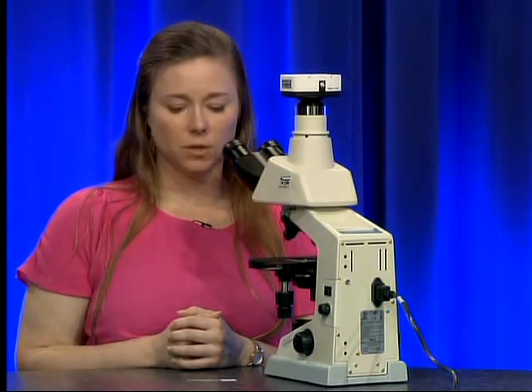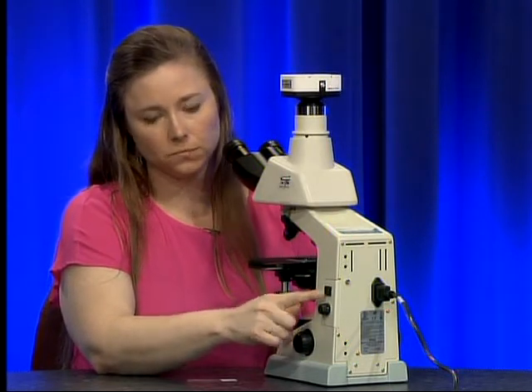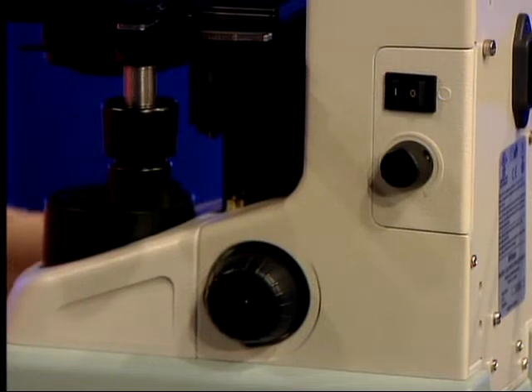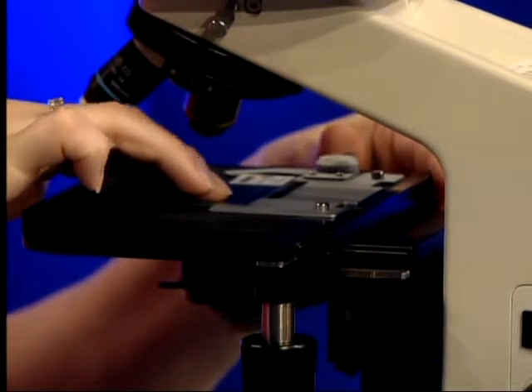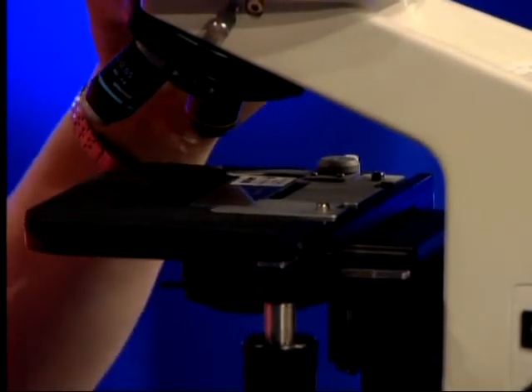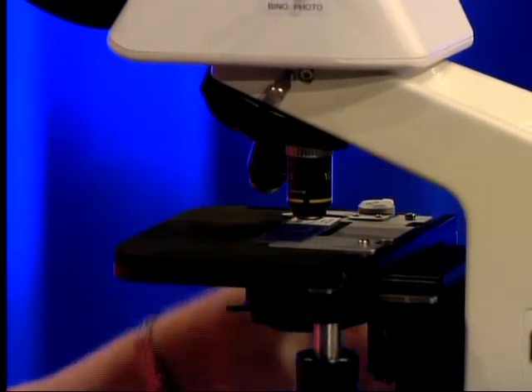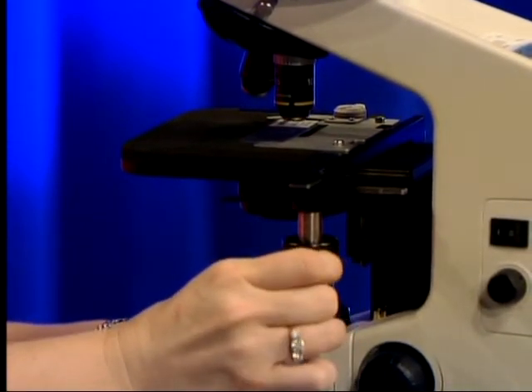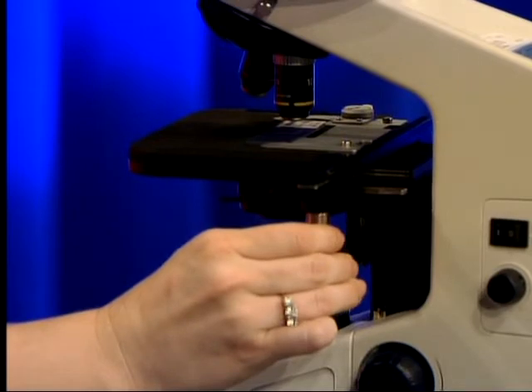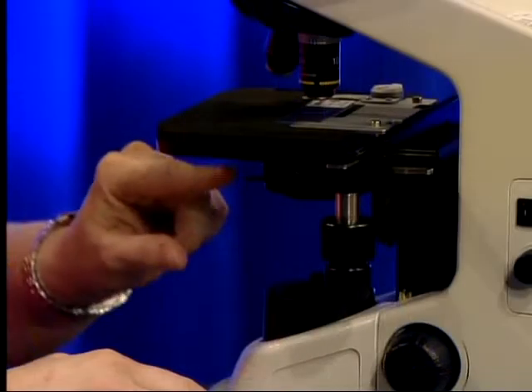Now we are going to use the microscope. Turn the microscope on using the power switch on the side. Place your slide on the stage, move the 10x objective into place over the slide, and center the cover slip underneath the objective. At this point, look down underneath the stage at your condenser and set it to the 10 mark.